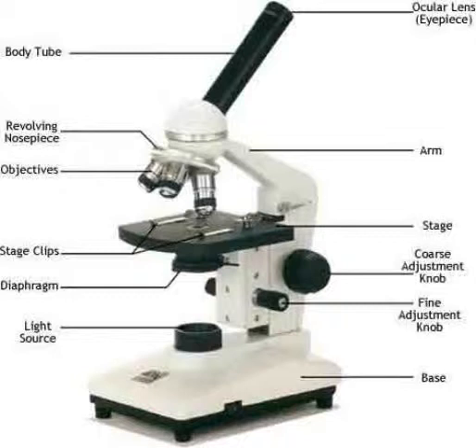Your microscope is expensive and fragile. It is important for you to use it correctly to avoid damaging it and to avoid breaking slides or destroying specimens. Always keep both eyes open when you look into the eyepiece. It is important because it reduces eye strain. If you find this difficult, cover your other eye with your hand. This may feel awkward at first, but it will become easier with practice.